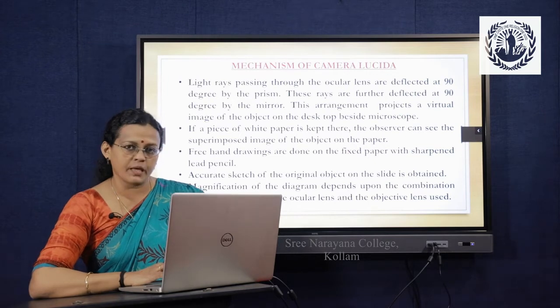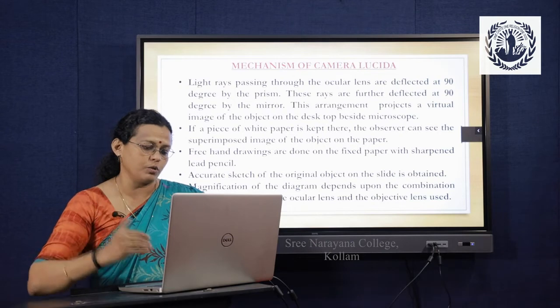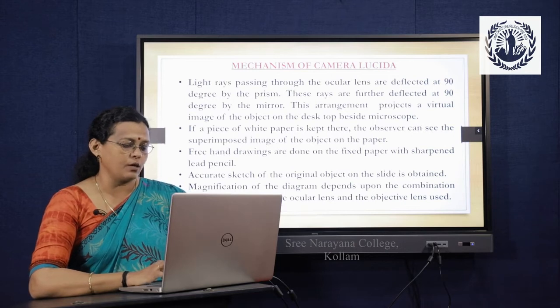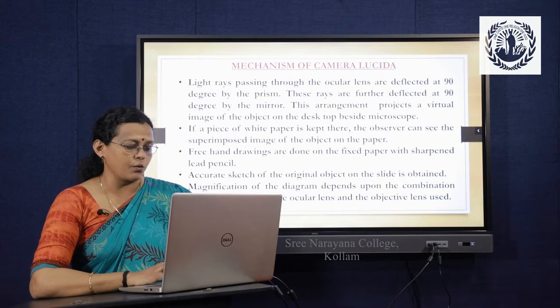If a piece of white paper is kept there, that is, the paper will be kept just below the mirror, the observer can see the superimposed image of the object on the paper. Freehand drawings are done on the fixed paper with a sharpened lead pencil. An accurate sketch of the original object on the slide is obtained.